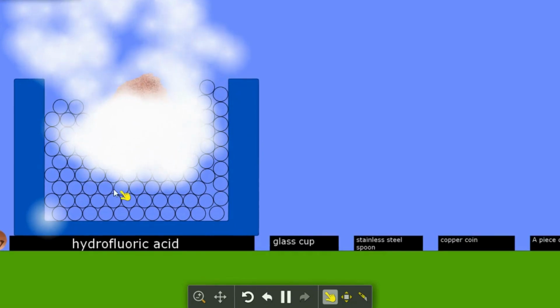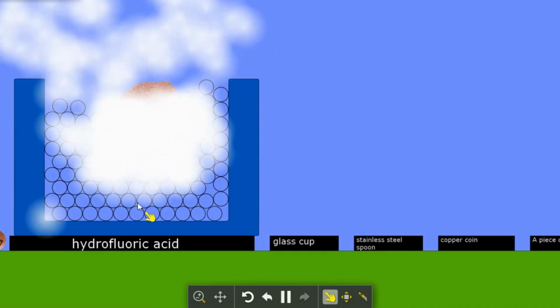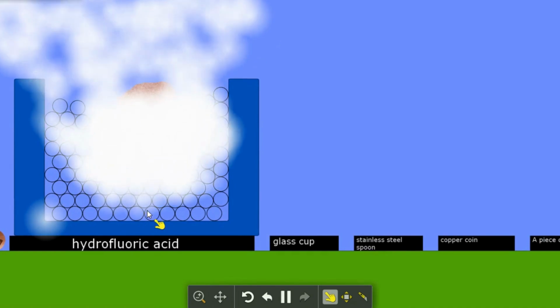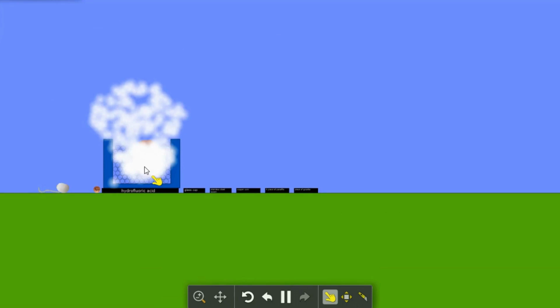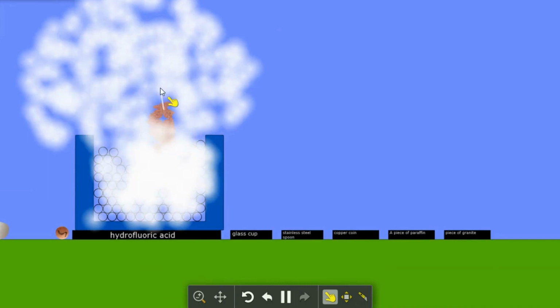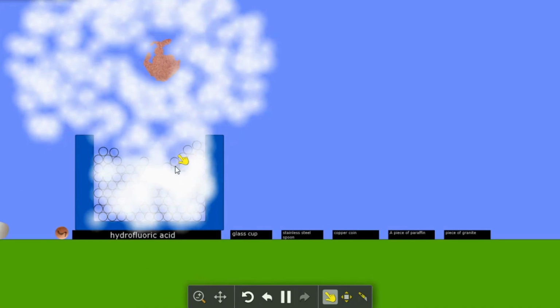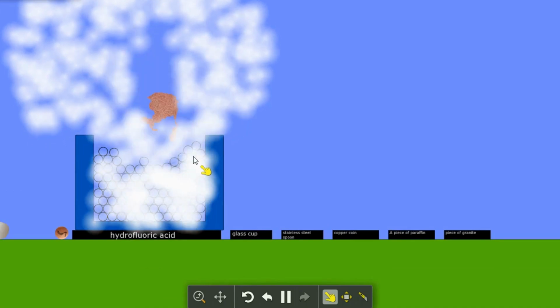I hope you enjoyed our hydrofluoric acid experiment. We have seen how it corrodes glass and other silicate materials, as well as how it does not react with some metals and organic substances. Hydrofluoric acid is a very interesting and useful substance that is used in various fields of industry and science. But it is also very dangerous and toxic, so you need to be very careful when working with it and be safe.